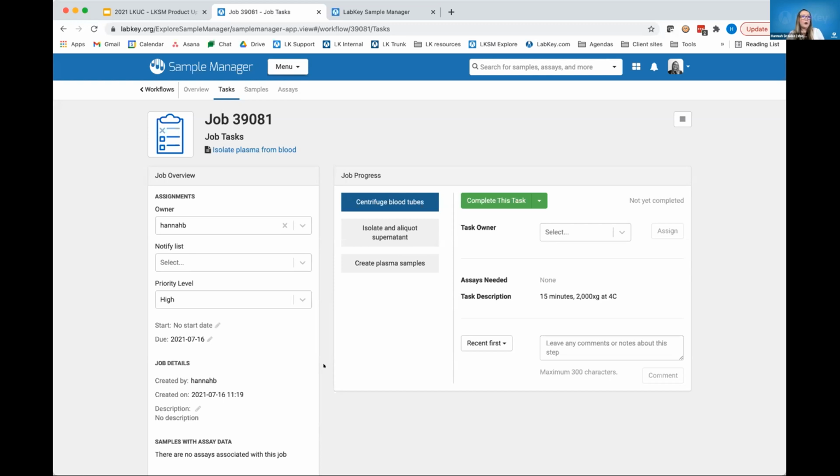I think we could easily have a link with our LabKey Server product that we talked about. Adam had mentioned that we have a lot of integration with S3. So typically you want to handle those larger files in a different place anyways. That would be my recommendation, although we would certainly work with you, if you wanted it directly here in this system, on how we could help support that.